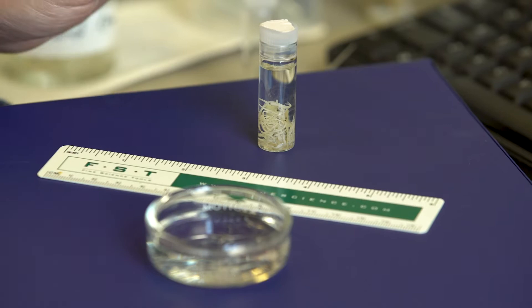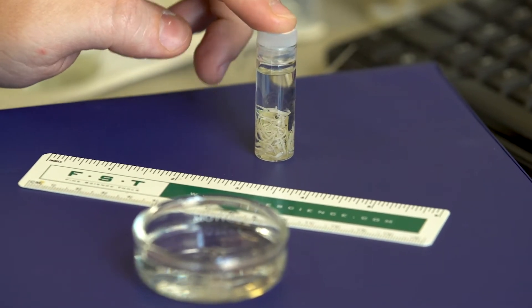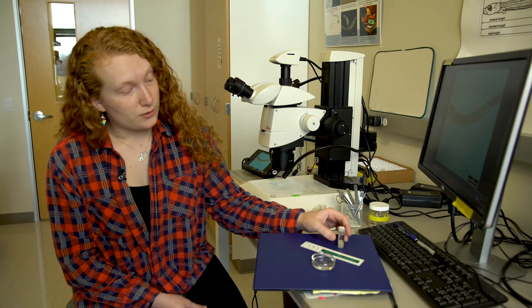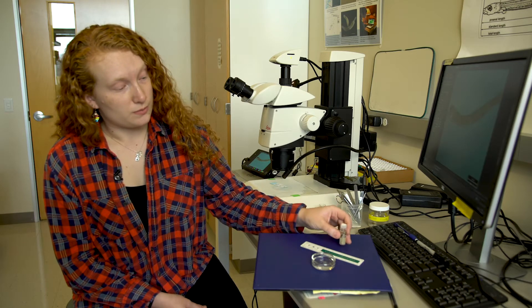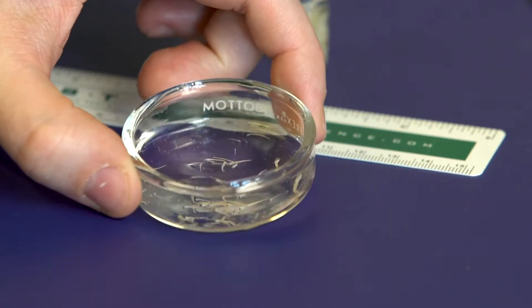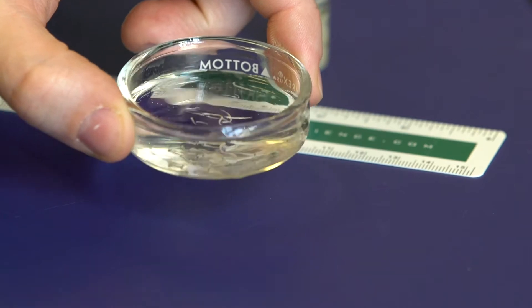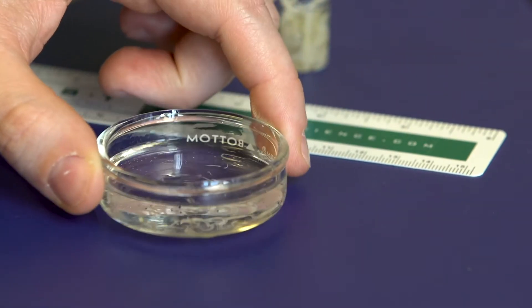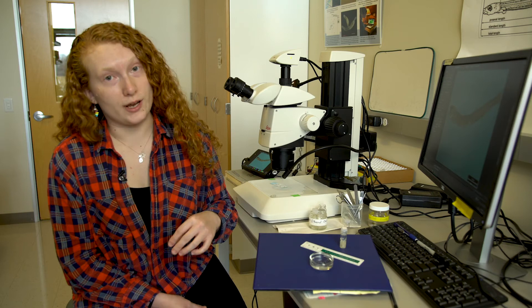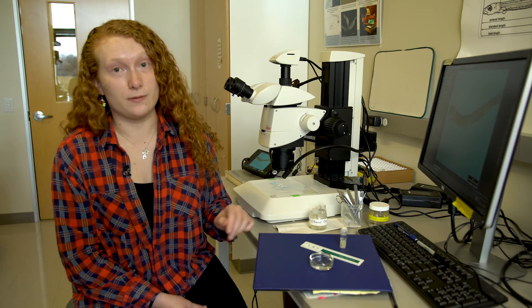So your end product from last time is going to be this little vial of preserved fish in ethanol. From this little vial you end up dumping it in a small dish where you have all of your fish to be identified. They're all in water because ethanol dries up real fast and you don't want your fish to dry up. If they dry up they become unidentifiable.